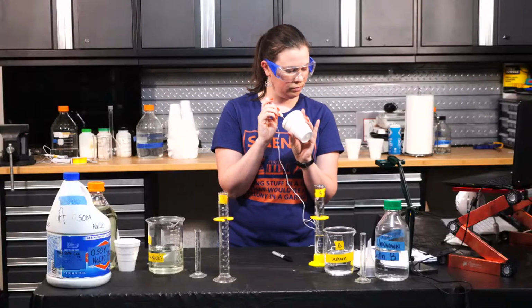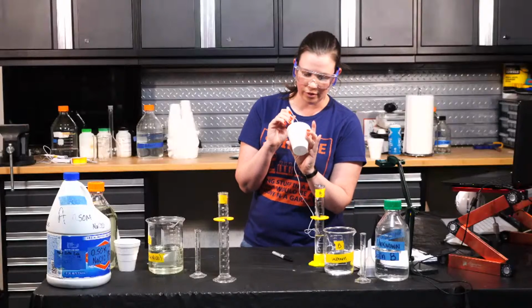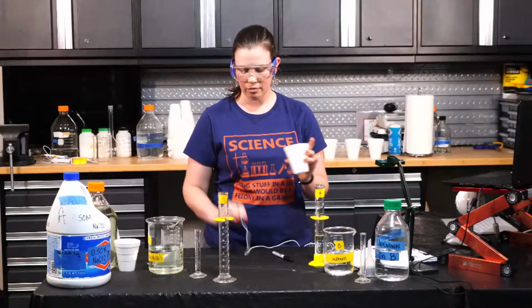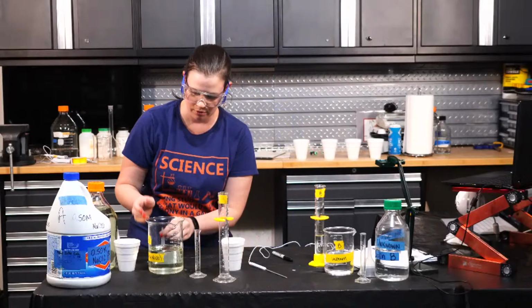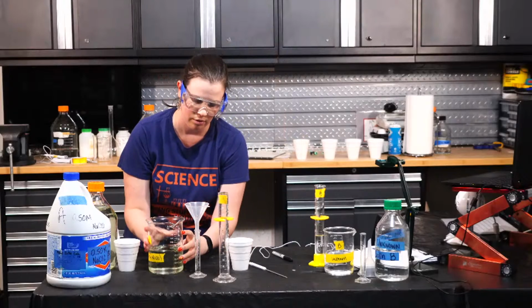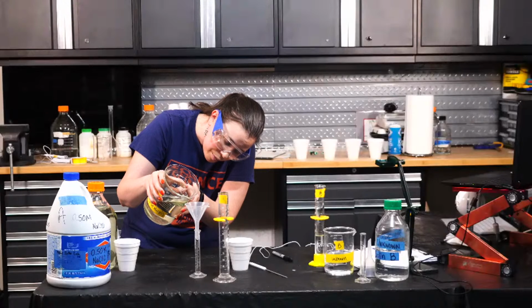It says 19.7, which doesn't seem right to me. So I think I might refill this 5 milliliters. New cup, nothing in it. Maybe I did accidentally put a drop in there or something.